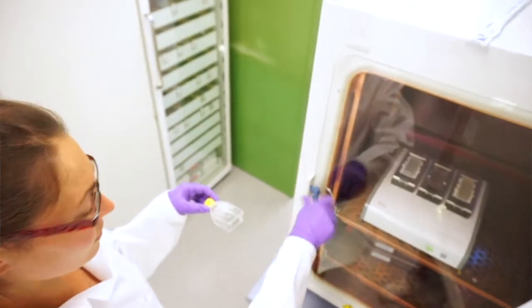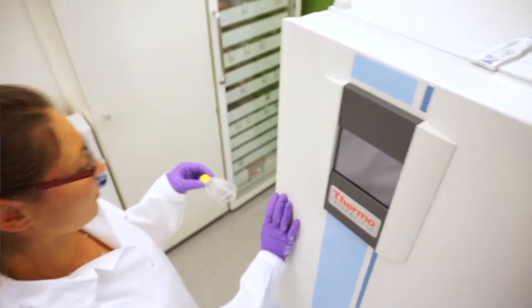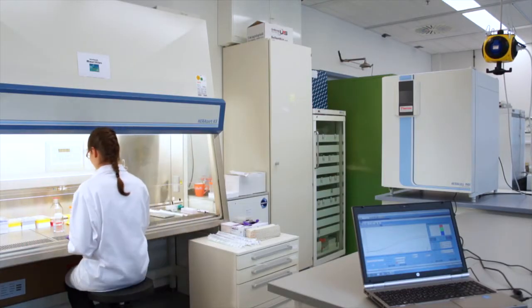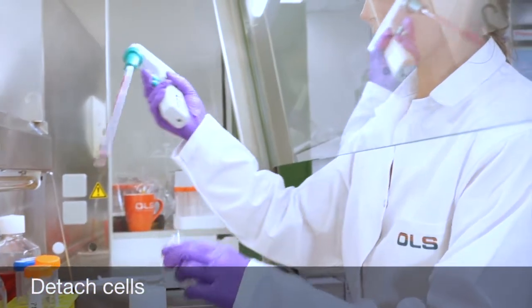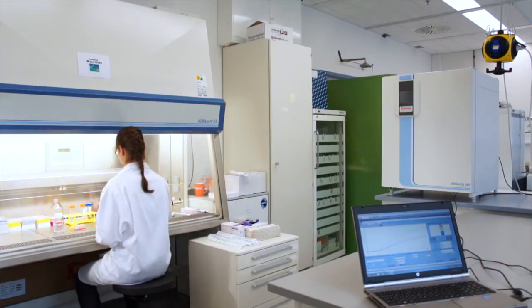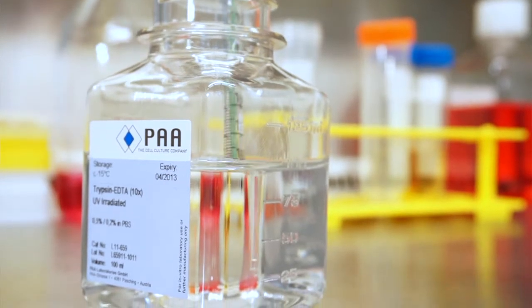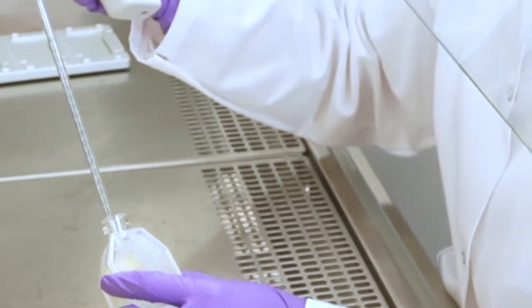Perform a cell migration experiment with the xCELLigence DP system. The station is positioned in the incubator, connected by cable to the computer, and provides three independent slots for 16-well plates.